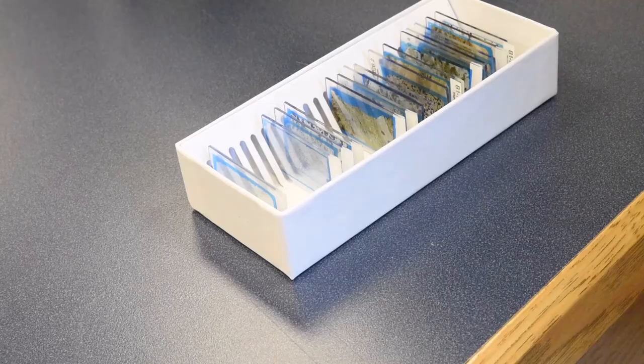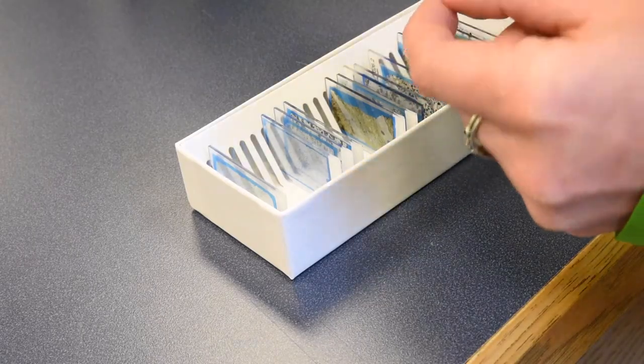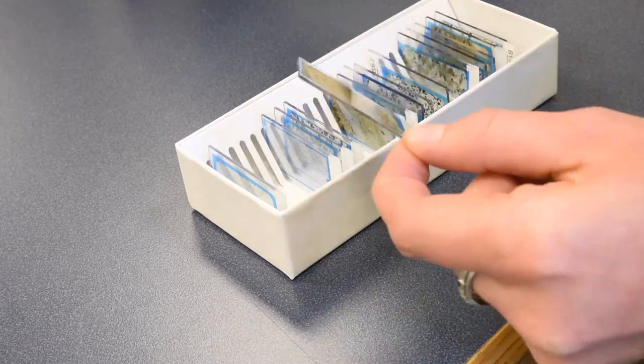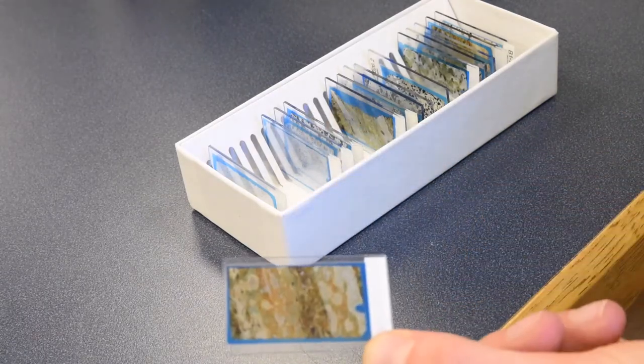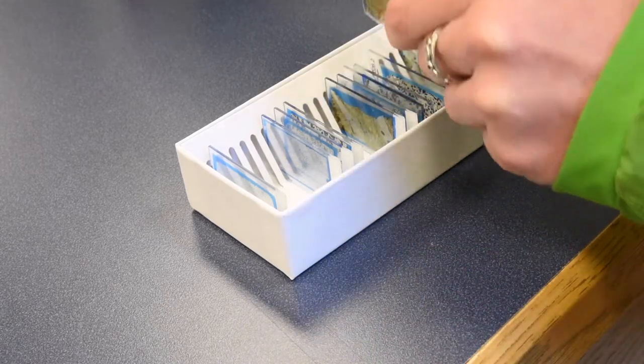In order to look at our samples under the microscope, we first have to make what's called a thin section, which is a really thin slice of a rock mounted to a glass microscope slide.